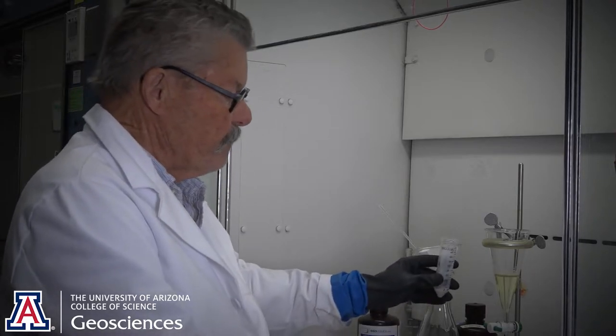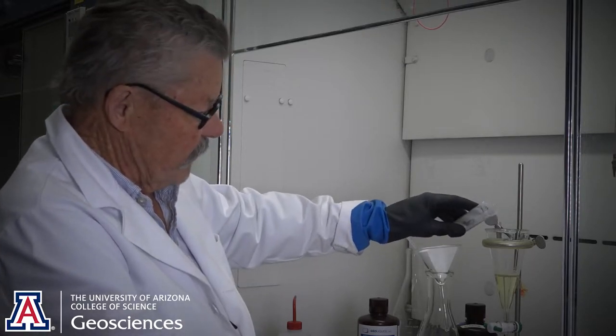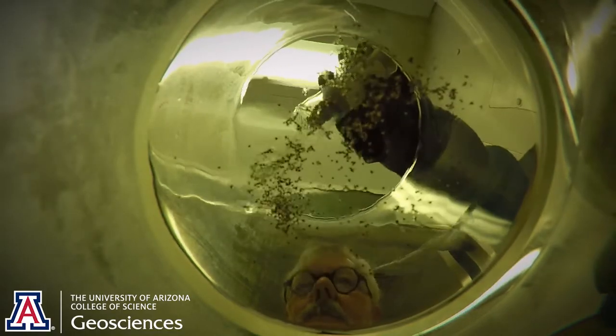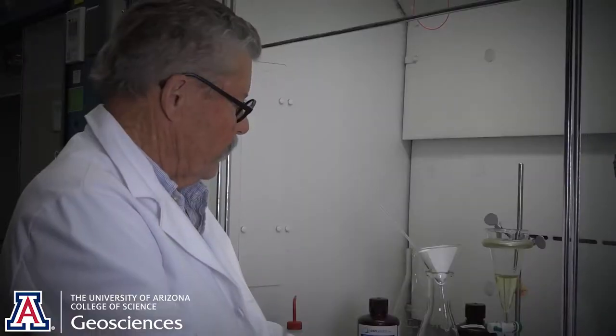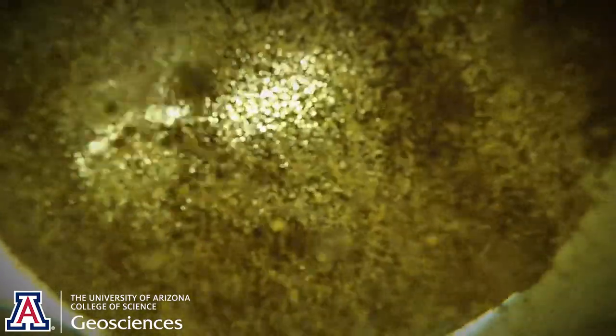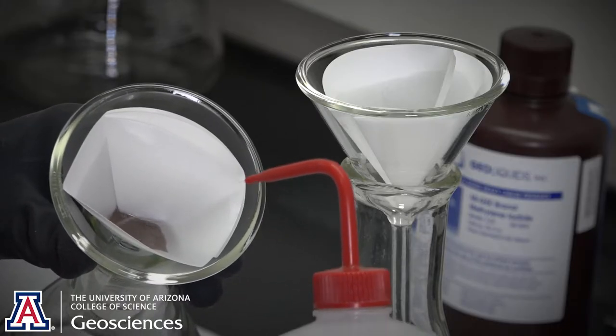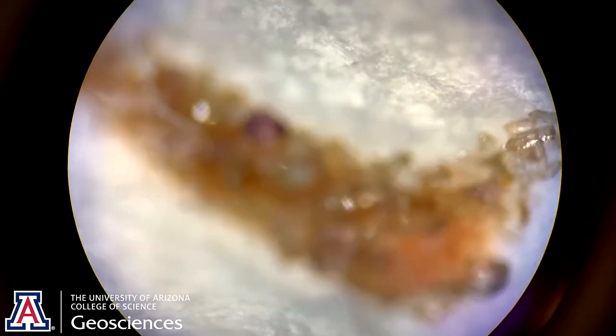Now we're going to separate minerals by density using methylene iodide, which has a density of 3.32. Heavy minerals will sink to the bottom; lighter minerals will float on top. I'm pouring in our sample now and stirring to allow the minerals to separate. Then we're going to rinse the zircons with acetone to remove all traces of the methylene iodide. These are beautiful, clean, igneous zircons.